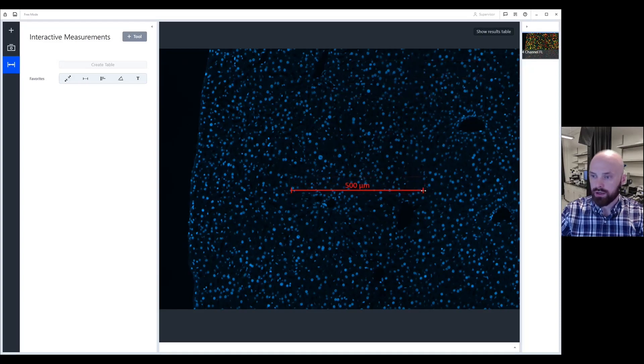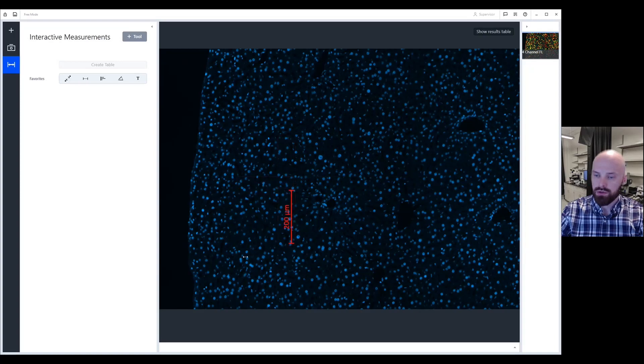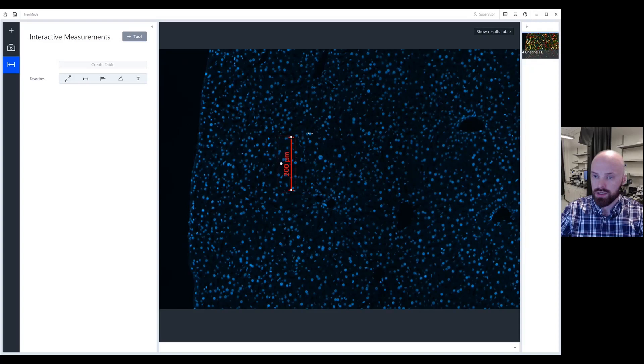If I click on one of these corners and I rotate my mouse in a clockwise or counterclockwise fashion, what you can see is I can resize or actually change the orientation of my scale bar to vertical or horizontal.